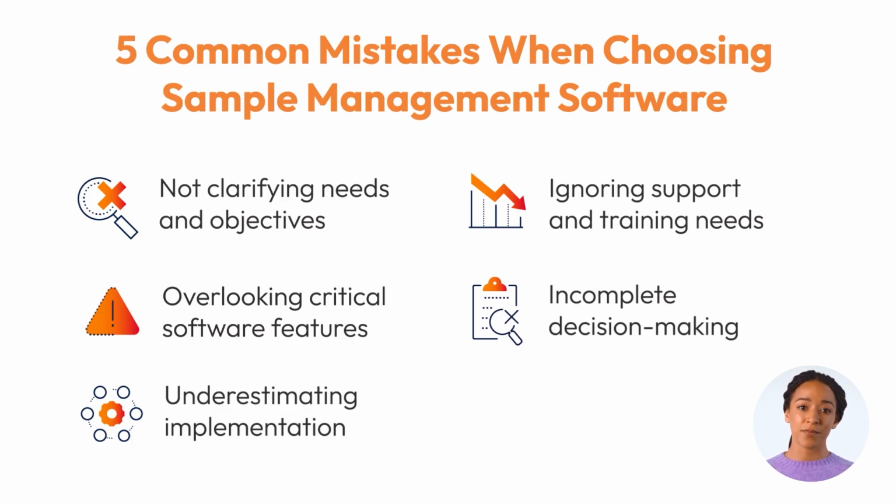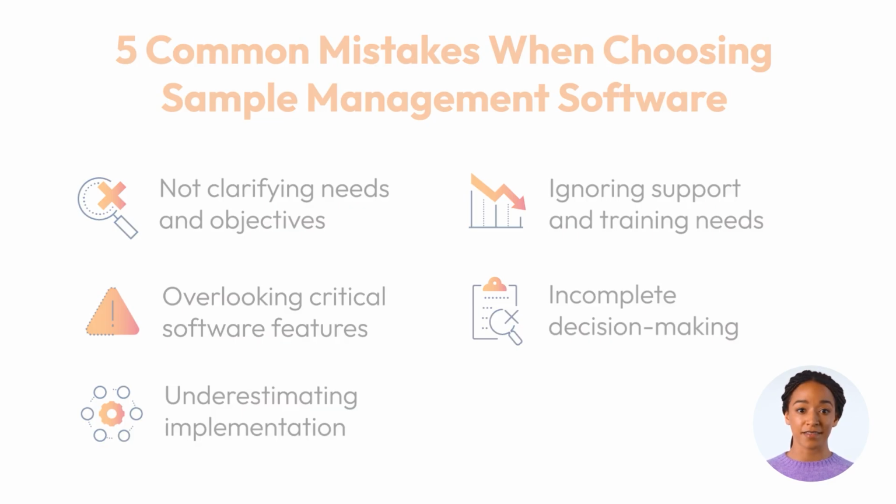Whether you're trying to find the best sample management software for a biobank, coordinating multi-site trials, or overseeing clinical operations, getting your sample tracking and data workflows right is essential to your lab's efficiency and data integrity. Let's start with where most people go wrong from the beginning, not fully understanding their needs.